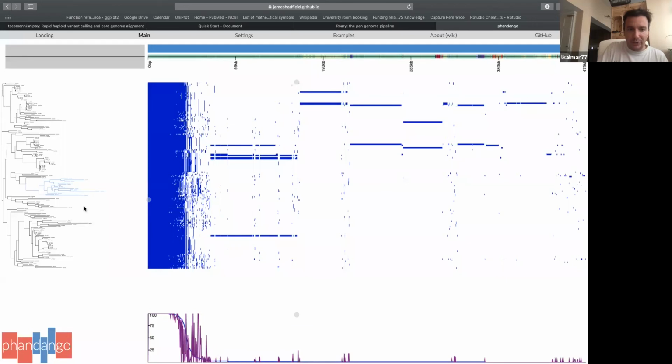So if you just click on this branch, you can see here a kind of histogram or graph, where the blue line represents the frequency of each gene within the whole data set. So if it's up to 100%, that means that those genes, the genes are here at the top, one by one. So all of the genes up to this point are present in all of your isolates, and then it goes down, and the genes here are present in just one or very few isolates.